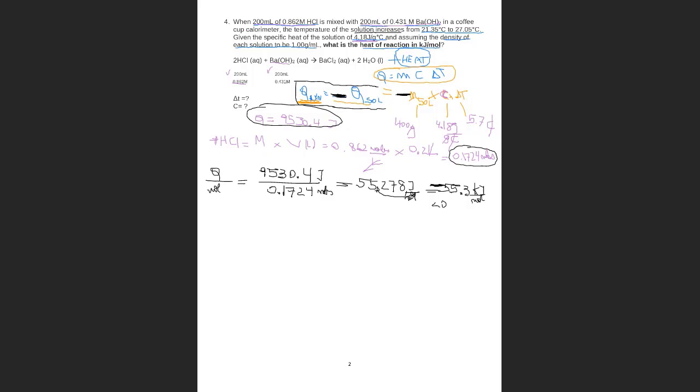And you can think of the reaction as just the mixture of the moles of hydrochloric acid mixed with barium hydroxide. When you mix them, they transfer the heat to the water. And you can divide that a little bit, but it's confusing. What is important is that the water absorbs the heat that was released when the acid mixed with the base.